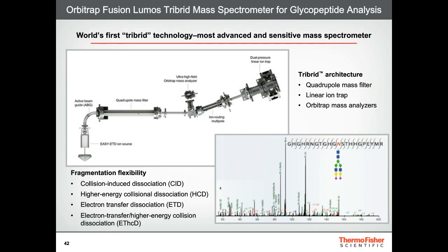When employing LC-MS analysis, data-dependent CID or HCD can be used for structural elucidation, whereas low-energy CID predominantly generates glycosidic bond cleavages, HCD can produce glycosidic as well as cross-ring fragmentation. HCD fragmentation mode provides necessary cross-ring fragmentation for glycan linkages and branching information. Furthermore, EThcD affords the ability of near complete sequence coverage and confident glycosylation site localization relative to HCD or ETD methods. These techniques support the glycopeptide analysis workflows for determining the location of the glycan within their respective glycoprotein.